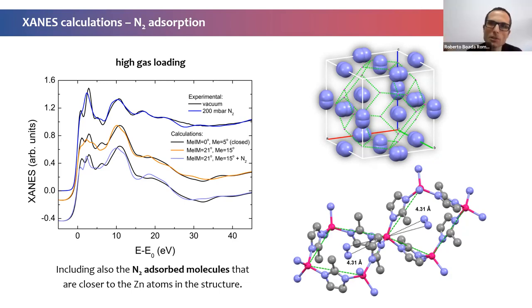I don't want to say condensation, because with condensation we see kind of liquid inside, but this is the picture. Once they reach the maximum loading capacity, even though they are not symmetrically distributed, in this particular case, I mean, I'm not saying that this is the fully accurate picture. I'm sure that in some cases there will be some nitrogen atoms that will be a bit farther away from this four window pore. There will be some others. So this is kind of an average picture.